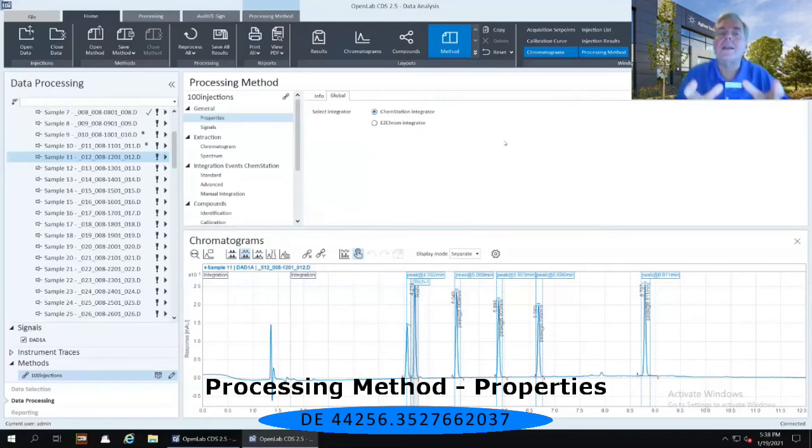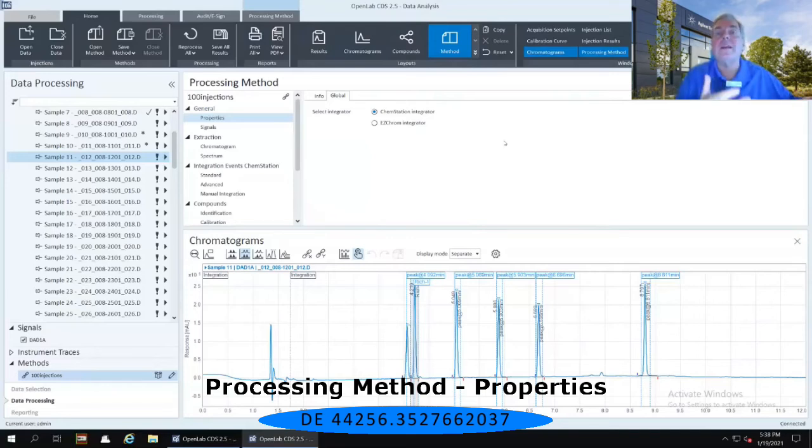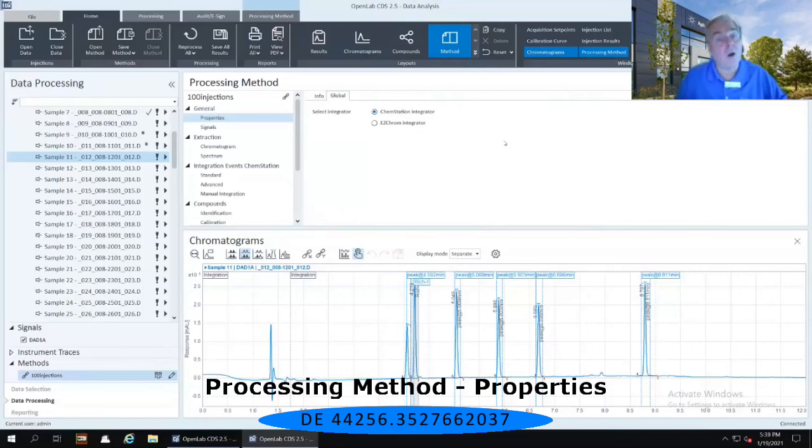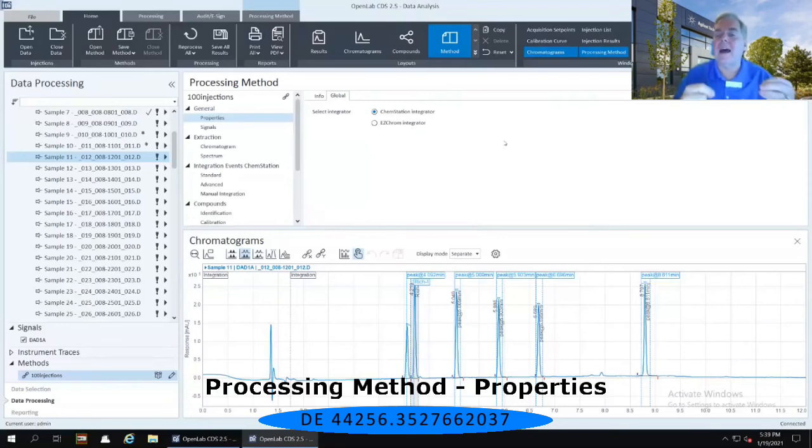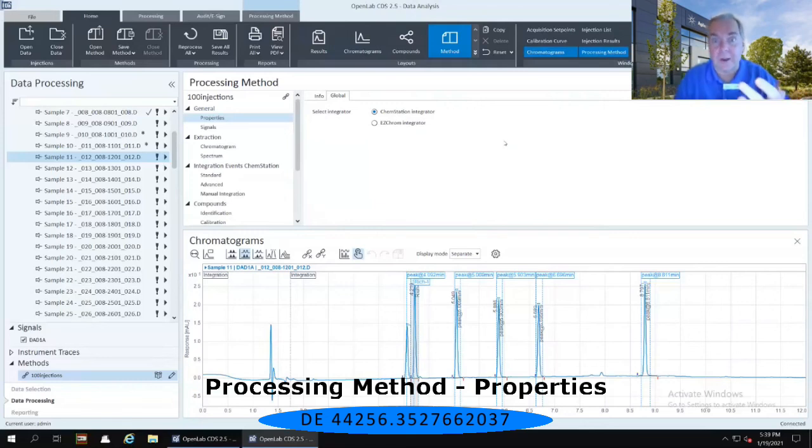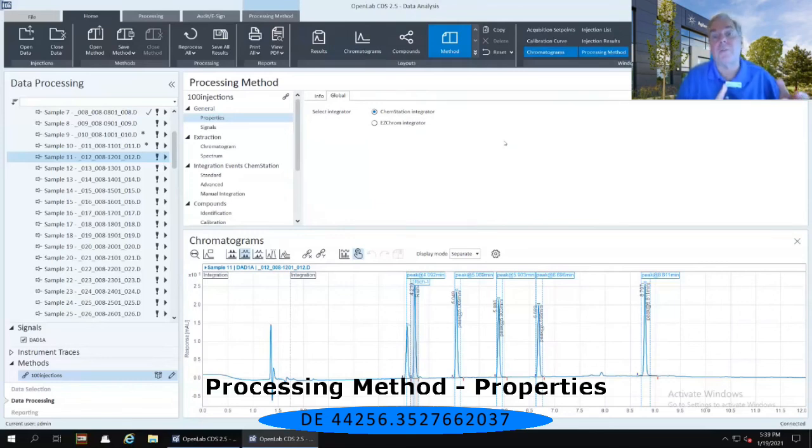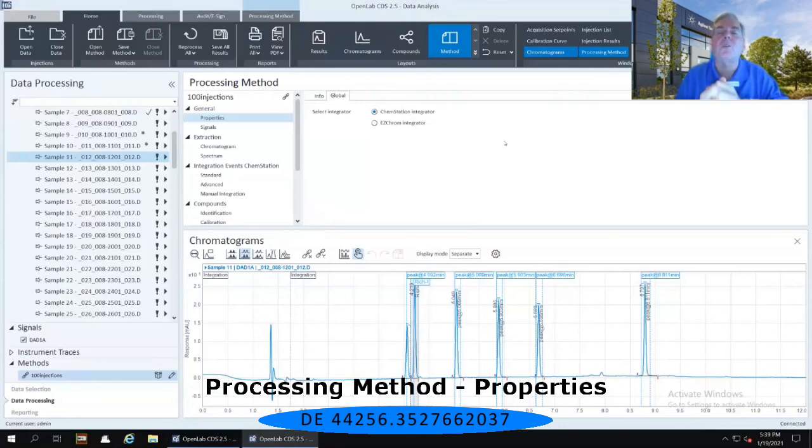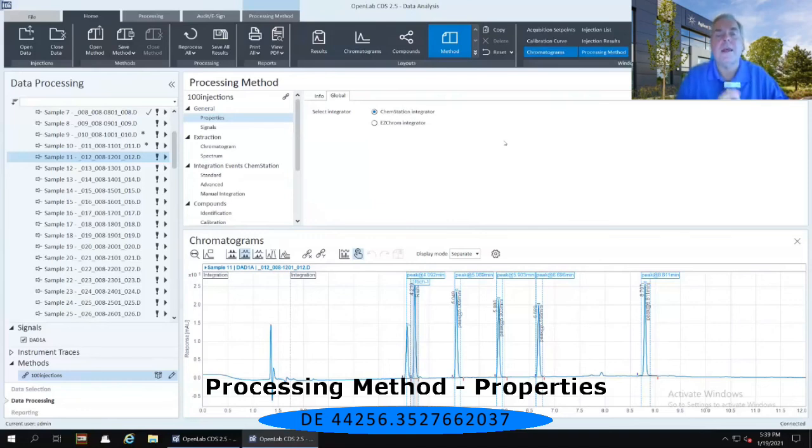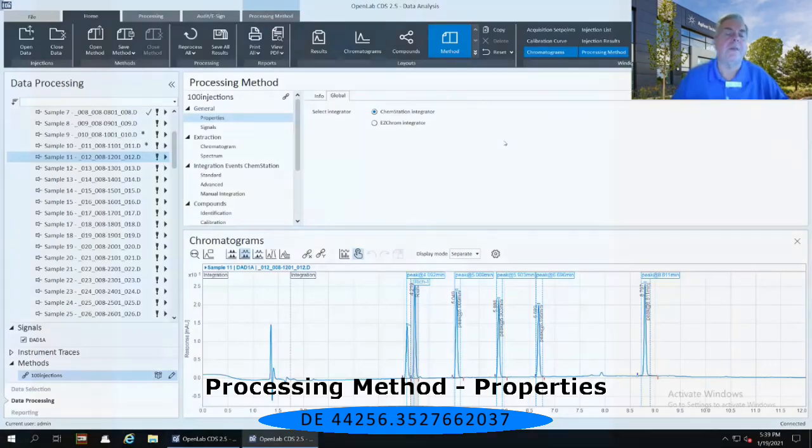And as you're coming from those older packages, we want to give you an opportunity to be able to see the data that you have already created in those older packages in the newer package of OpenLab CDS. We also want you to be able to get at least approximate, if not exact, numerical values of things like your integrated results from those previous software packages. So we incorporated both of those integrators directly into the CDS system so that you can then use whichever integrator you feel most comfortable with. In this case, we're going to keep it with the ChemStation integrator.